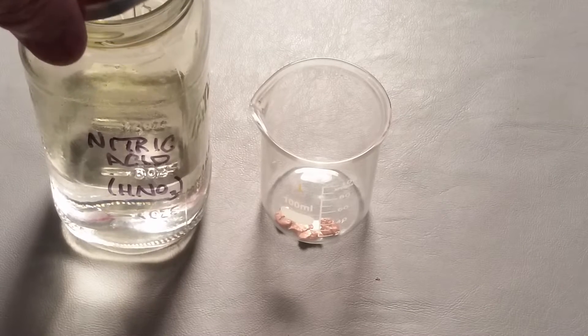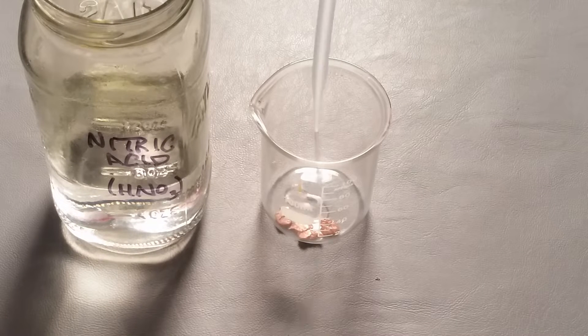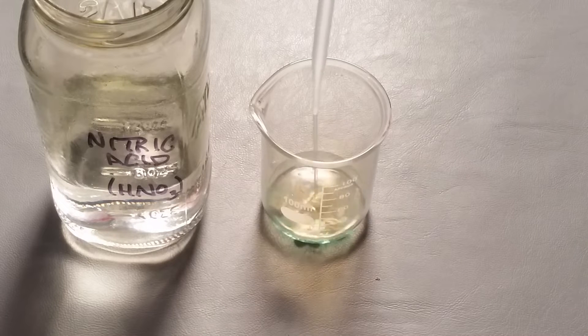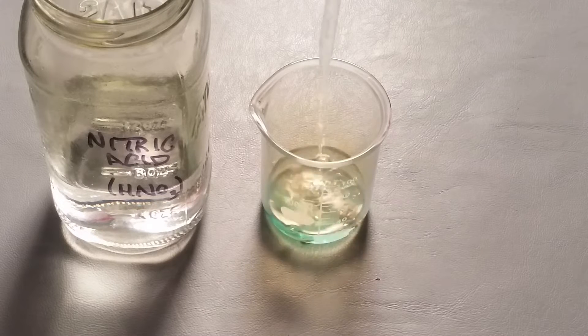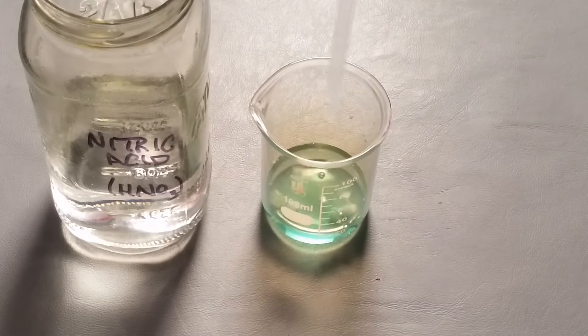This should eventually turn to a deep blue or purple color — it may take weeks for it to happen. You can see the copper reacting as it bubbles away.